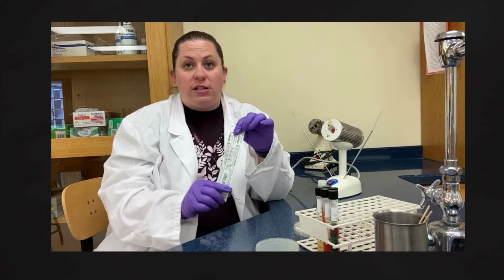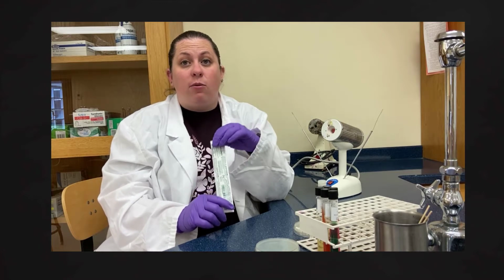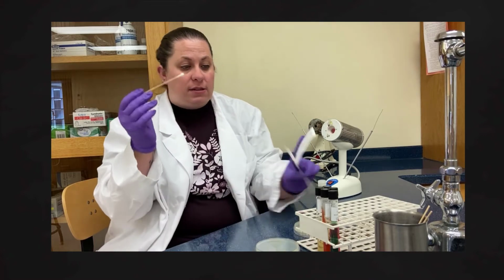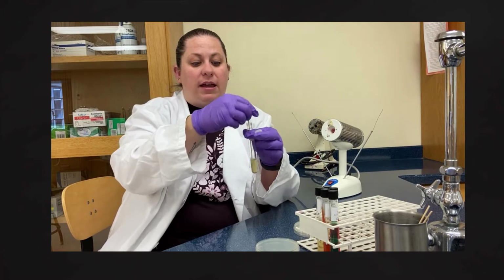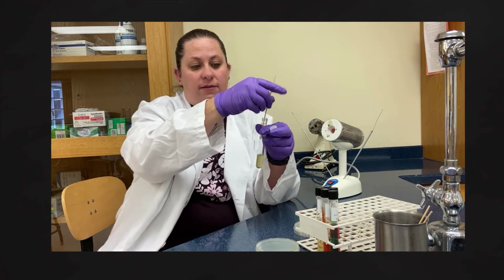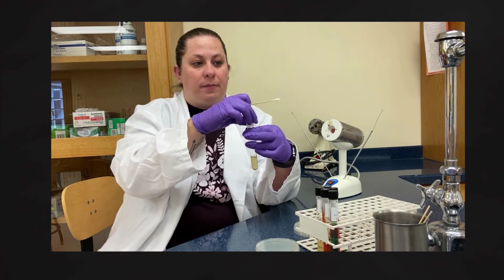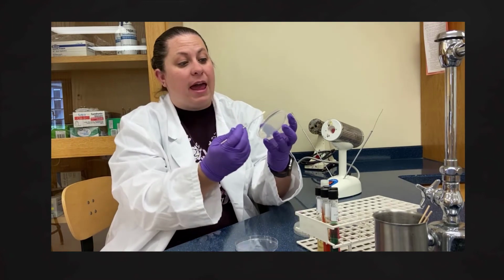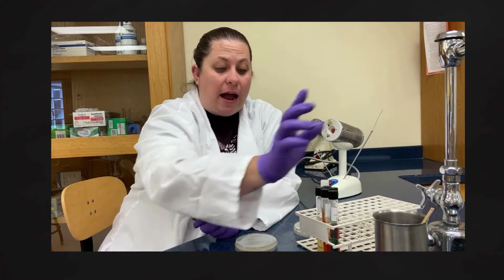All right, so to start off with our streak plate inoculation, we're going to use a sterile cotton-tipped applicator, just like we saw with our spread plate, but we're going to use it a little bit differently. We're going to put it in here where we collect the bacteria, and get the excess off. And what we're going to do is take our plate and put a line, just a line across there. That's all we're going to do with that. And then we're going to get rid of our applicator.